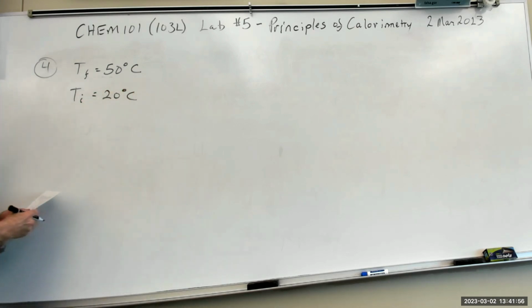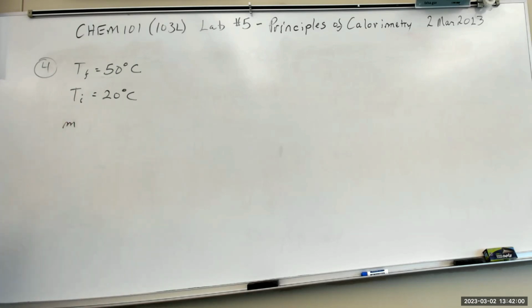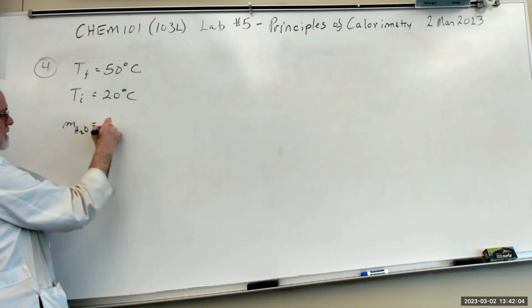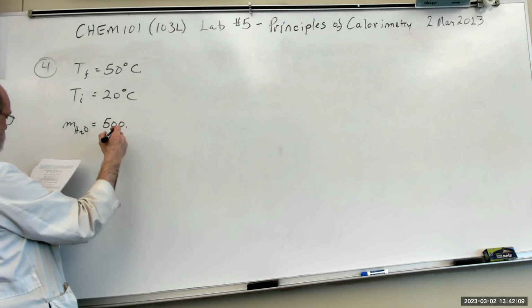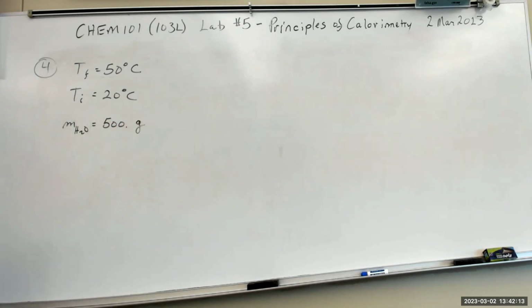Okay. Yes, the mass of the water will be 500 grams, because it's milliliters, it'd be grams.